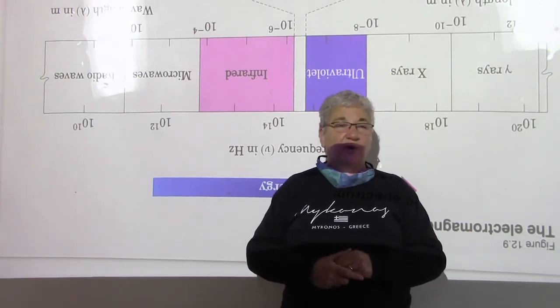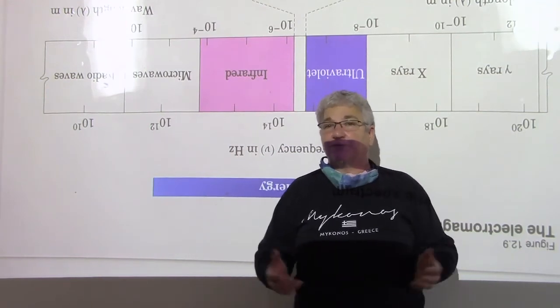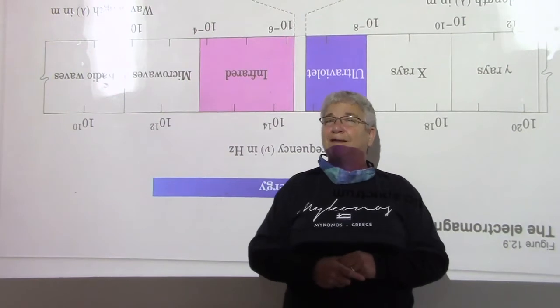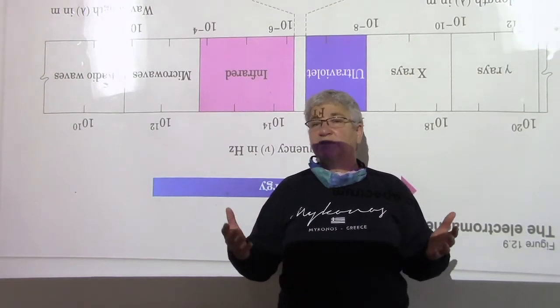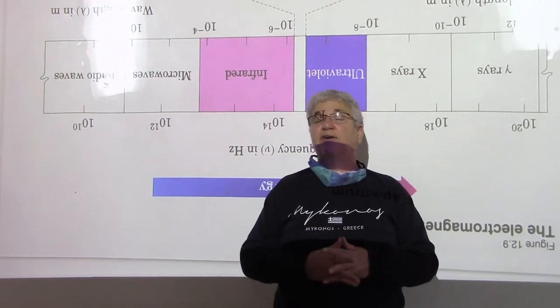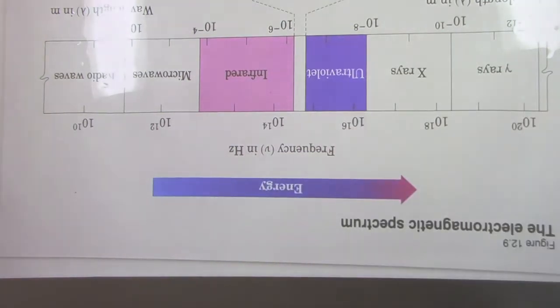So it's very quick, it's very easy. It gives you a little bit of information about your molecule because it gives you information about what functional groups are present. And again, not all functional groups are IR active. We'll see which ones, but many of them are, and that actually is often very helpful when you're trying to figure out what your molecule is.